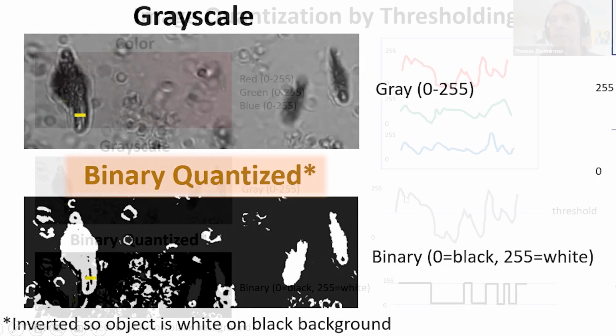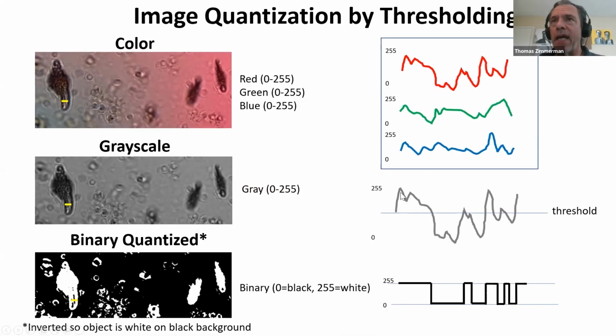And what the blurring does is basically average it. You notice this peak is going down. Oh, here's a good example. See this peak, it crossed over. If you averaged it, it would have been a little smoother, and that wouldn't have popped up and crossed the threshold. So that's why smoothing, averaging reduces those holes you'd see, and this would appear as a hole in the object. Okay, so this hard threshold does this quantization.